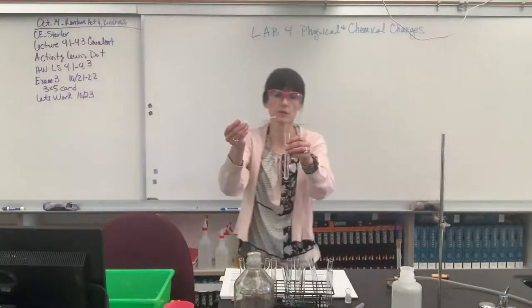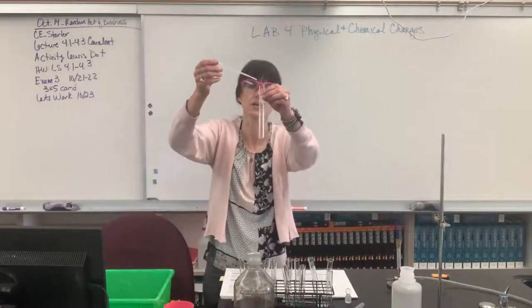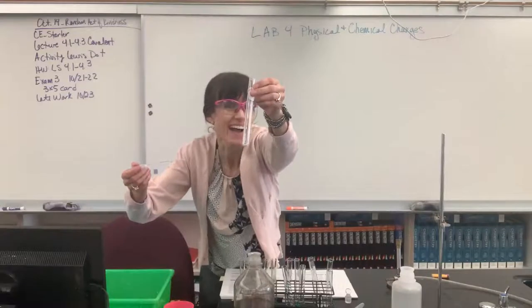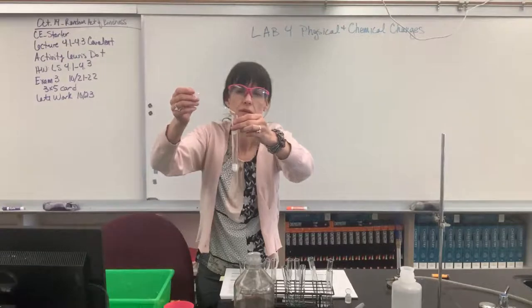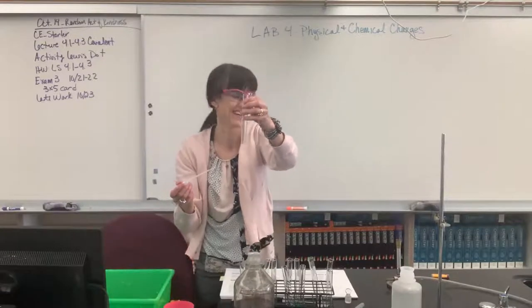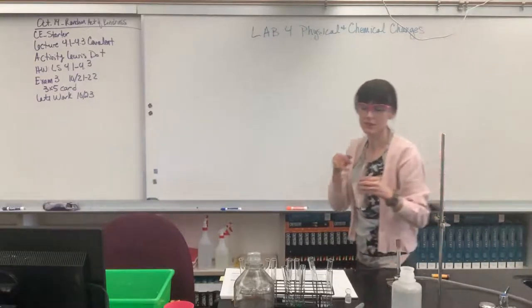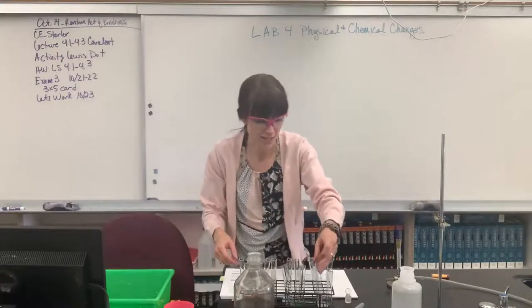Let's add the drops to it. Okay, let's see what happens. Let me make sure it was 15 drops. Okay, here we go, 15 drops. See what happens. 1. I wanted you to hear that. It's reacting, it's fizzing. Awesome, check that out, woo! That was kind of fun. So there was a reaction. There is definitely a reaction. It evolved gas. You could hear it evolving gas as it was reacting, releasing those little gas bubbles. Let's go ahead and write that down.